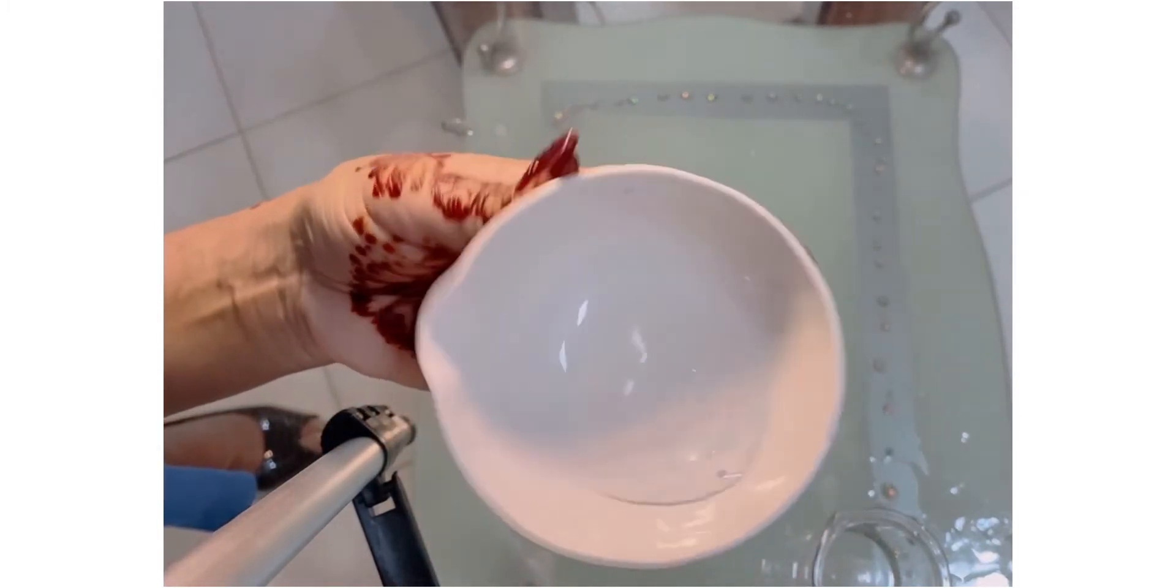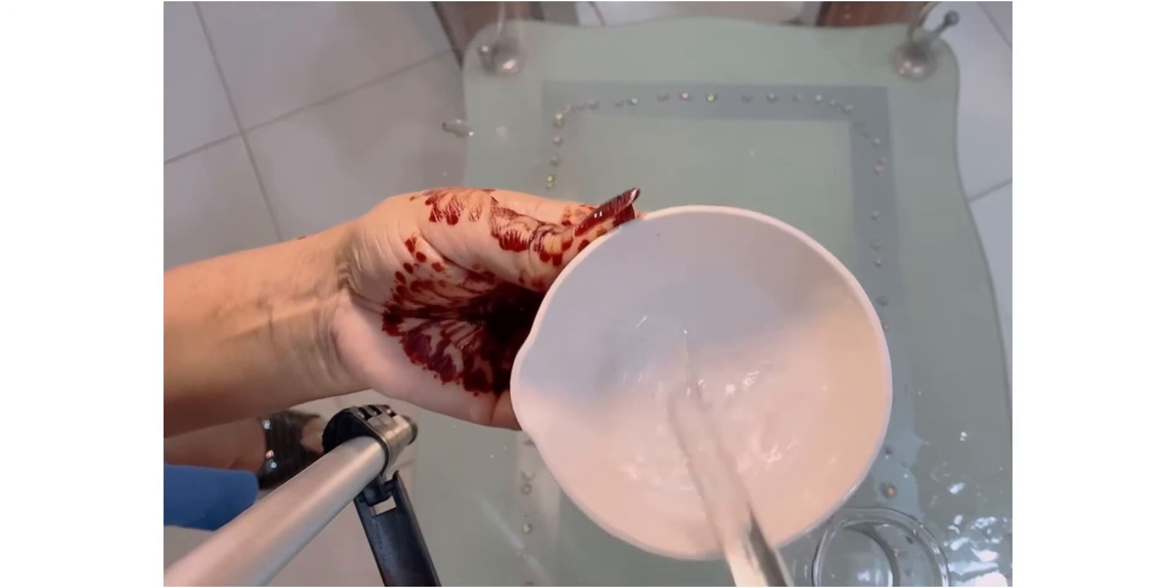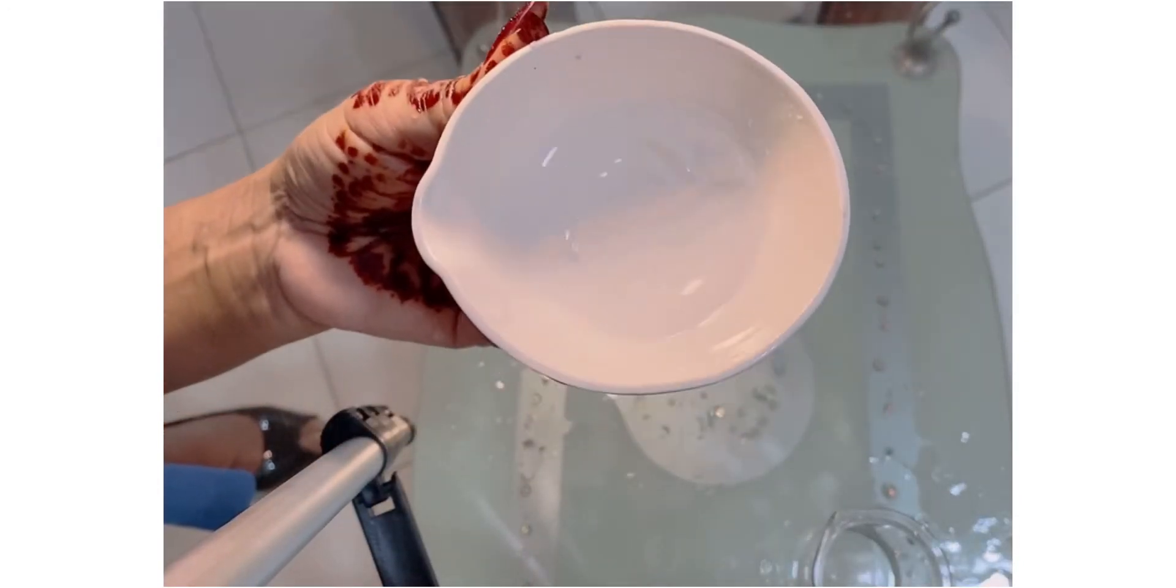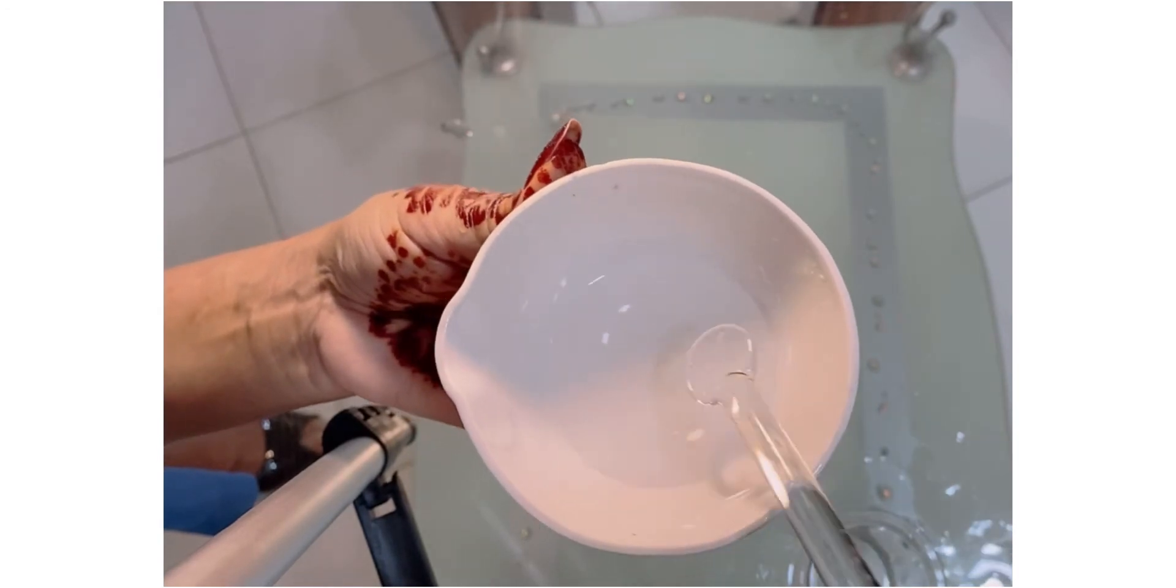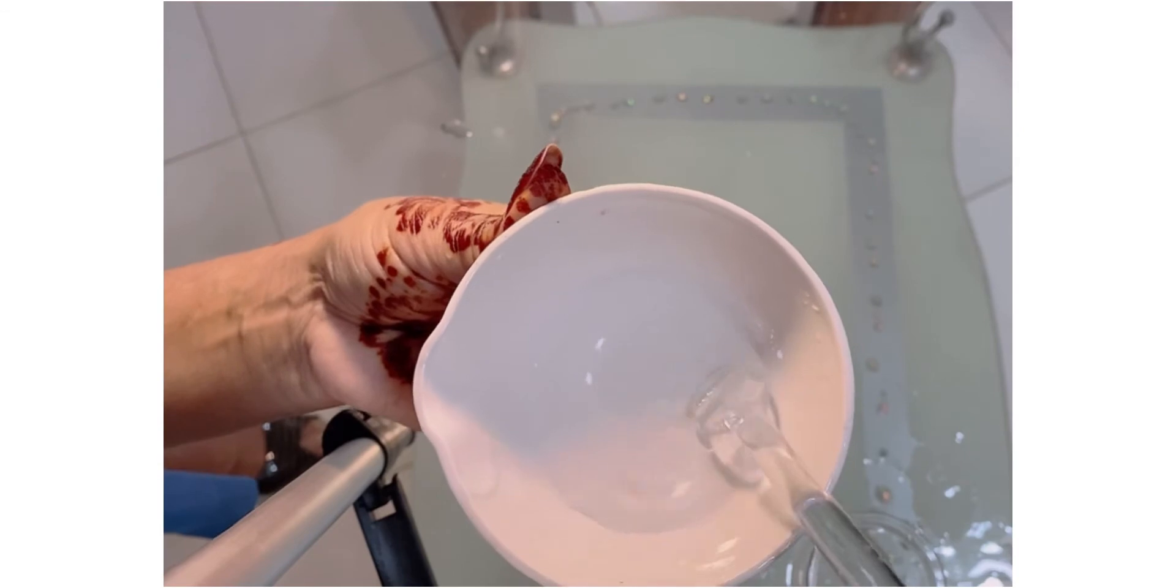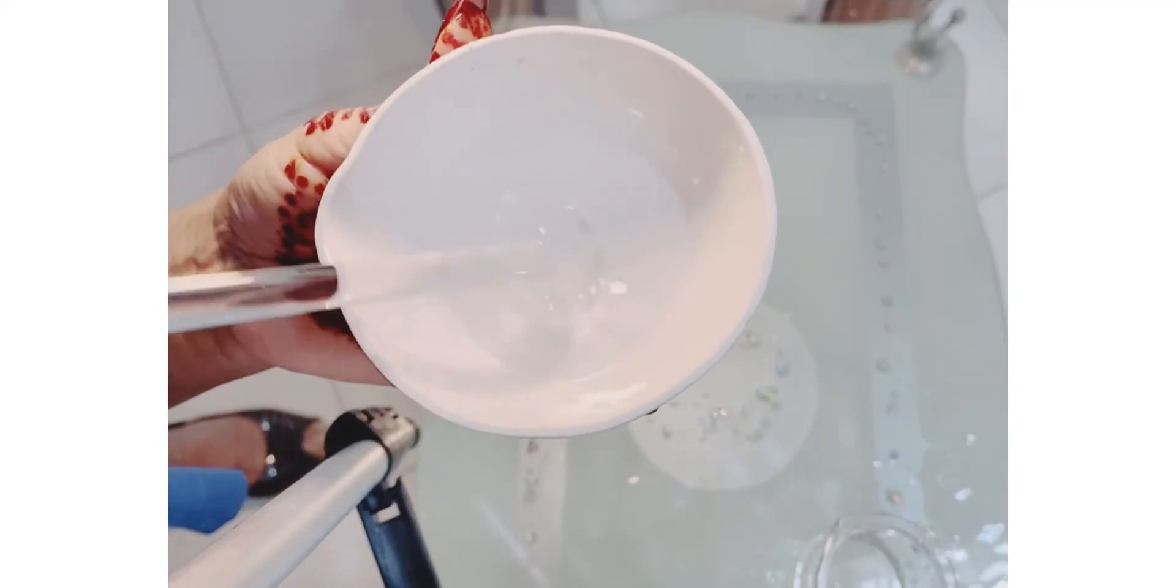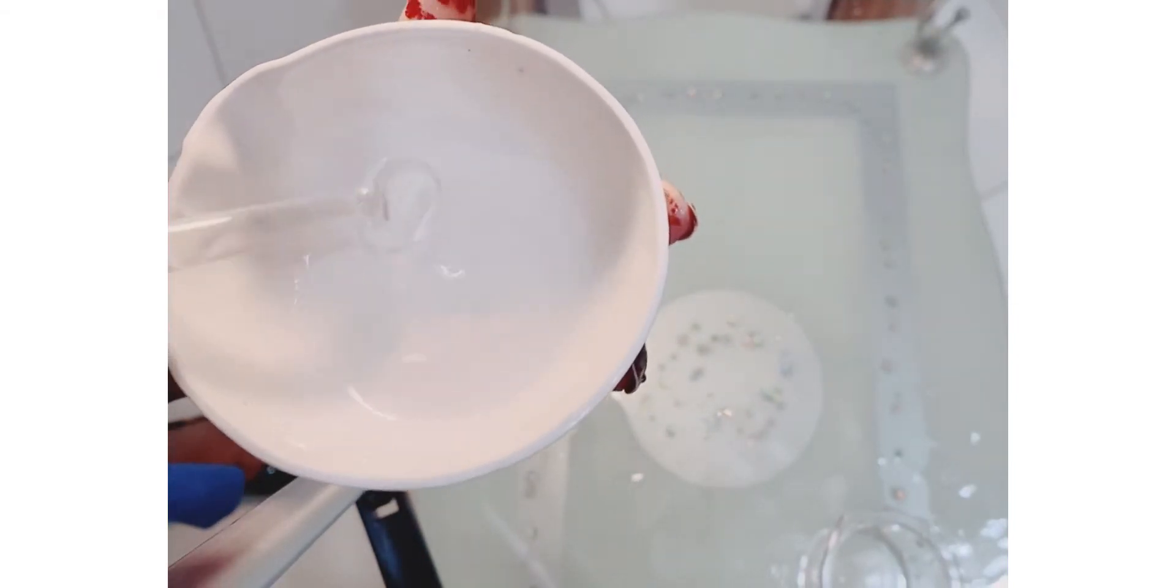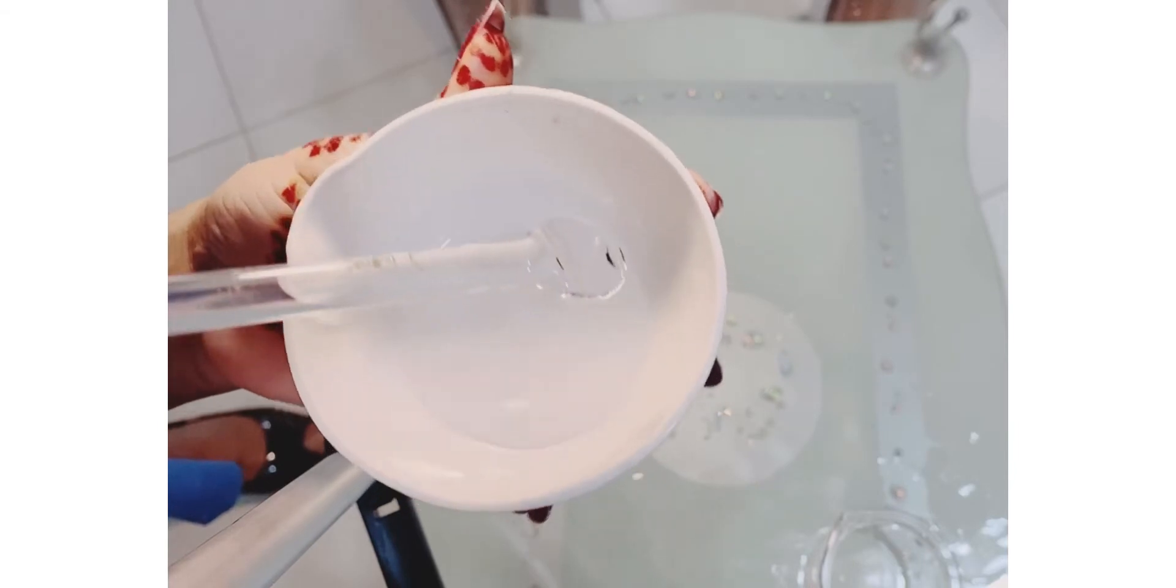Your solvent will spill, or by stirring roughly. You do not need to do all this. We simply stir it with a glass rod slowly, very softly, soft strokes. So if you need to swirl very softly or slowly when you are dealing with this china dish.